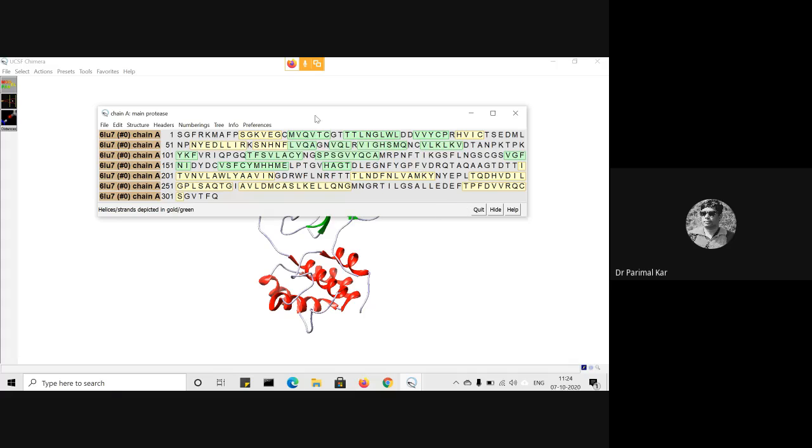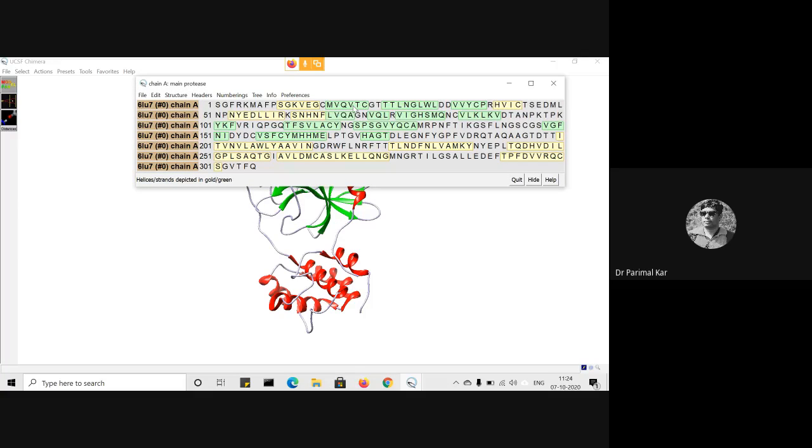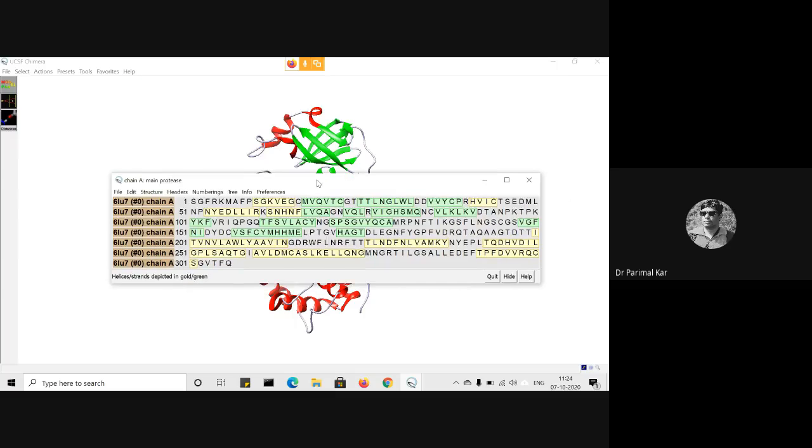Okay, and you also see that there are different color shades actually. So here you can select all that structure also. Just click one of the structure or cursor. This is the serine, no? So I just cursor here. Then it shows the number here. Which number is this? So just click one of the residues or cursor on the residue. Then it's serine 10 chain A. Okay. Similarly, this residue is glycine 174A. Okay. Similarly, for each residue we can show its residue position also.